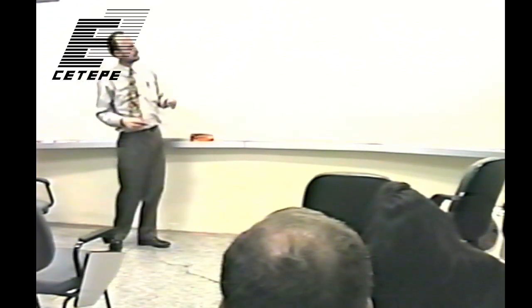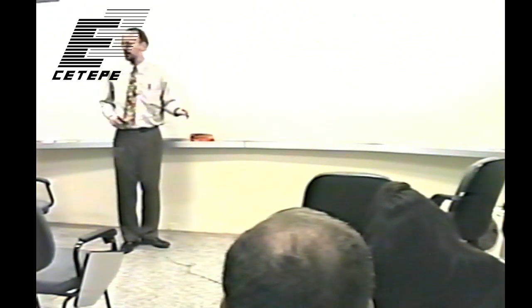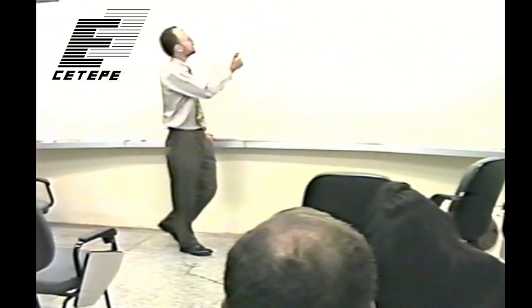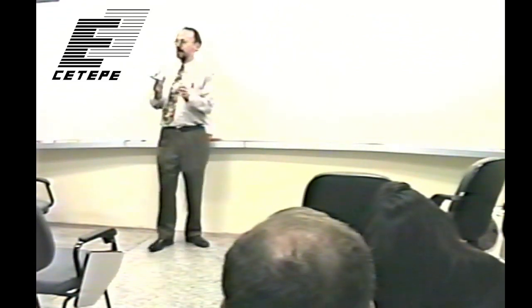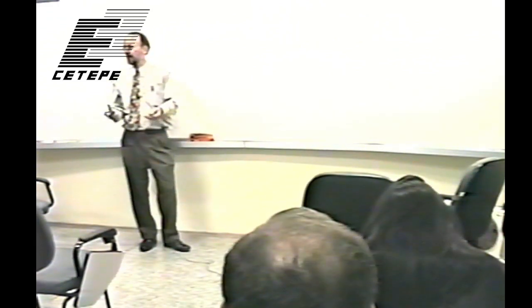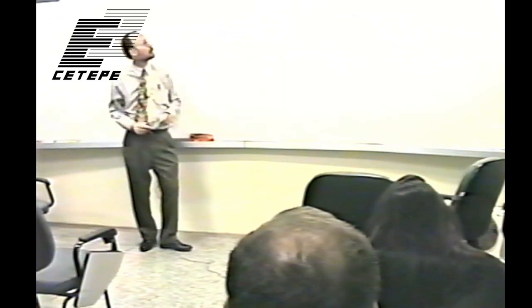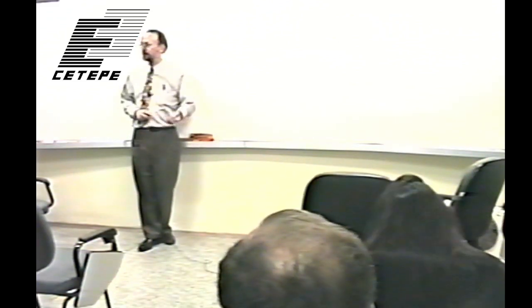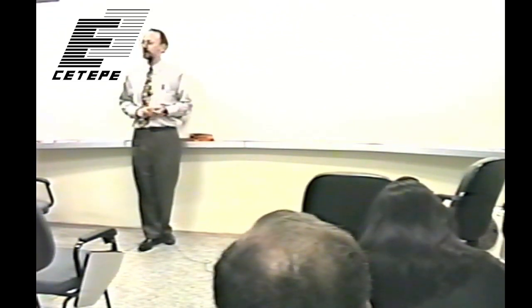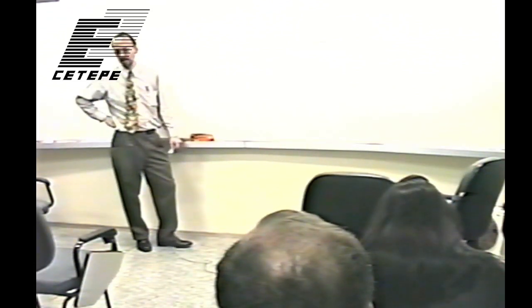And then, if you ignore the reflective layer, only half of that light has any chance of going to the film. So there's another factor of 0.5. And even with a reflective layer, because you add these black powders and you have self-absorption of the light in the screen, that factor is never greater than 0.5, usually quite a bit less than 0.5. So if you multiply these out, you're way under 10% in terms of converting X-ray energy to image information. So this is a problem with all detection systems, including film, and it's a very inefficient kind of proposition.